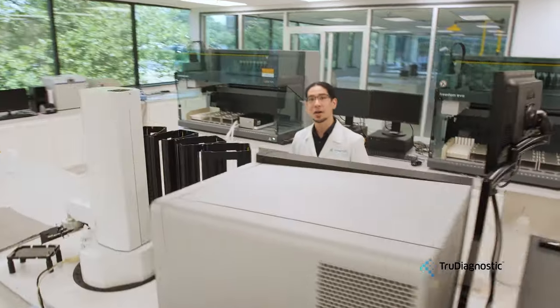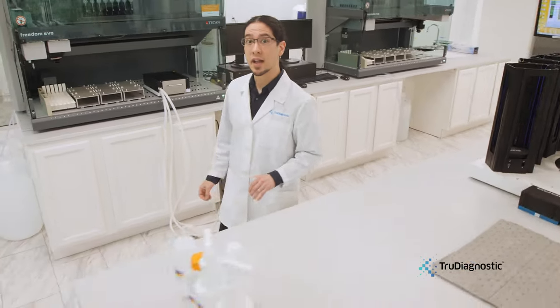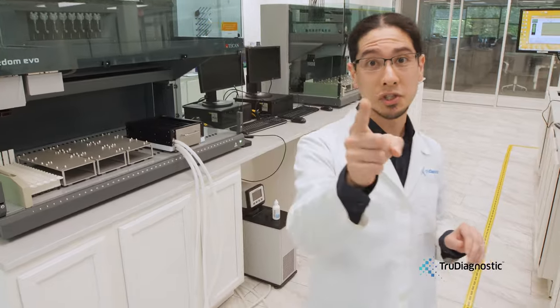Hi, welcome to TrueDiagnostic. My name is Tavis Mendez and I am the lab director for TrueDiagnostic, and I am excited to show you our 5,000 square foot facility where we will find your true age.